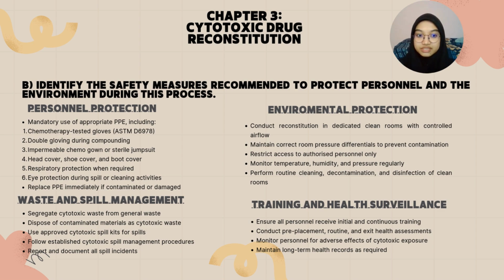Spills require immediate response using a cytotoxic spill kit and following established procedures. All spill incidents are reported and documented for safety quality assurance.